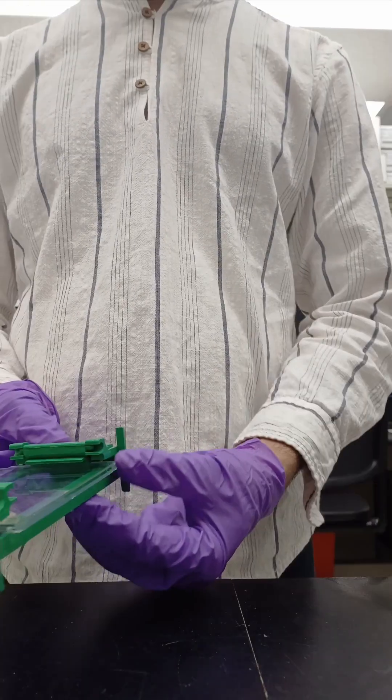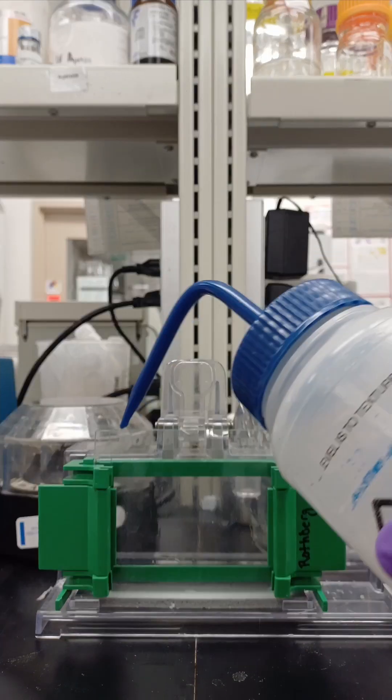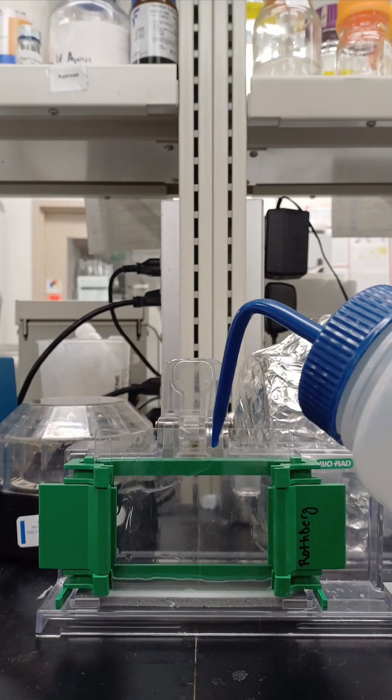Clip the plates together, make sure the edges are even. Now attach them to the casting stand. Pour some water or isopropanol between the plates to check for any leakage.